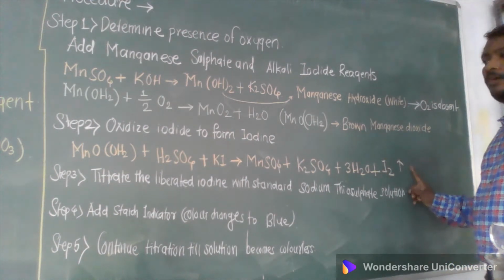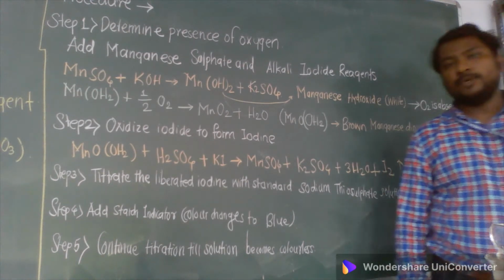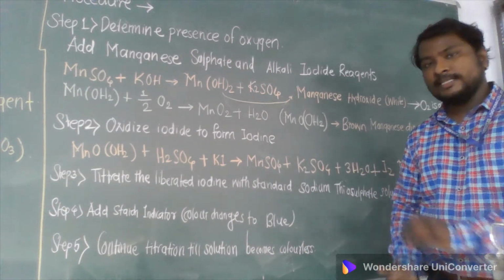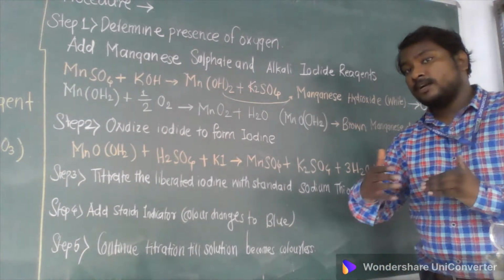Liberation of iodine has occurred when you have added the concentrated H2SO4 into the sample, and it is an indication that we are nearer to the end point.